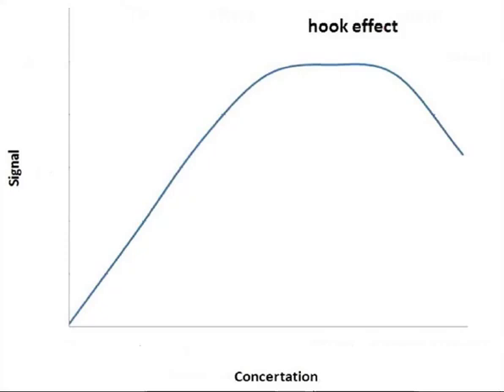And at the end, for getting the real concentration, you have to find the dilution in which there is no overmax and you have a concentration with an ascending trend. For example, in 10% dilution to 20% to 30% dilution, you see that there is an ascending trend from a lower concentration to a higher, and it's gradual.